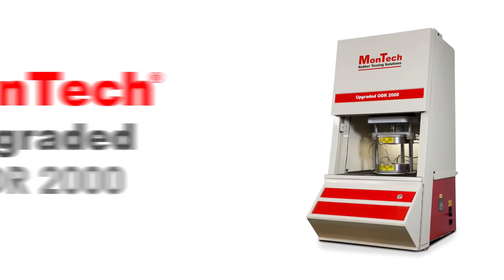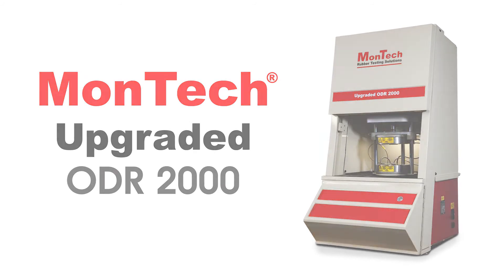The Montech upgrade package is a great choice for modernizing your testing instruments on a limited budget. Contact us or visit our website to learn more.